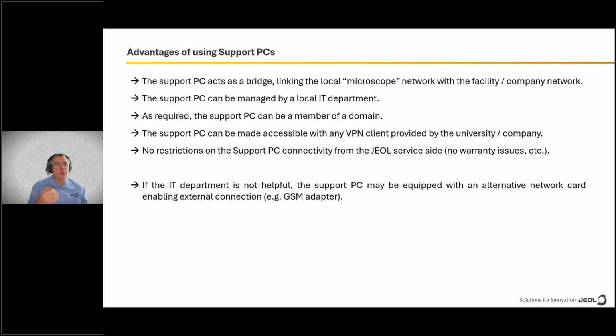The scenario that we want to create is one in which the support PC or the camera PC acts as a bridge. So you can log in to this support PC remotely, and from that PC, you can then access the microscope computer or the camera computer or your local data storage PC or workstation, or any other workstation that you may be using in this context.